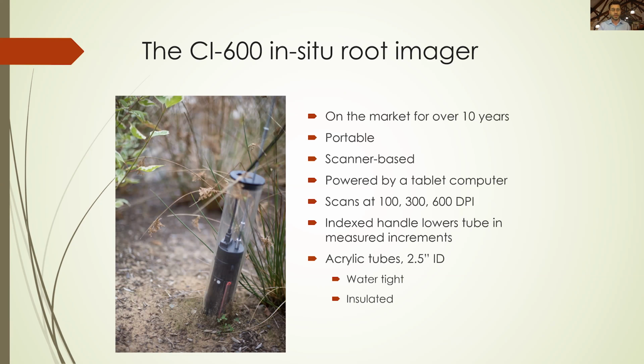When we give out the CI-600, we also provide 6 acrylic tubes, as you can see here, actually clear. We will be talking a little bit more on that later on. We actually provide them singly as well. If you already have a CI-600 or 602, we'd be able to get those for you.